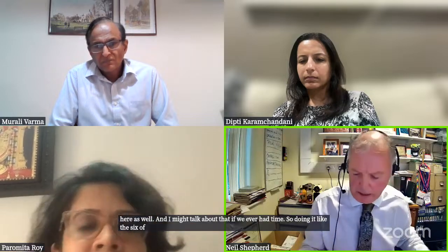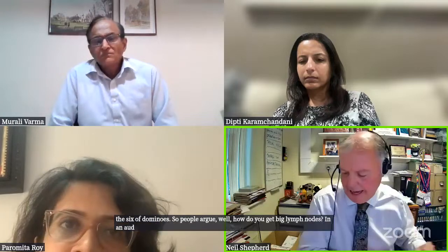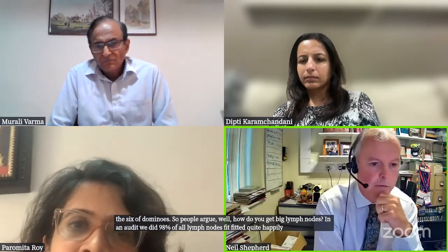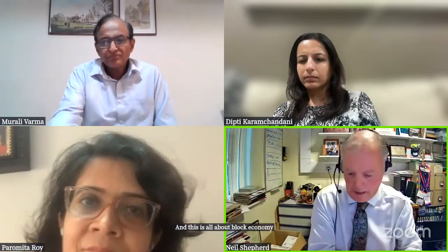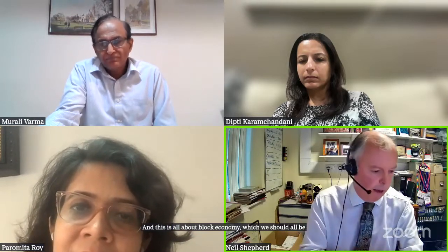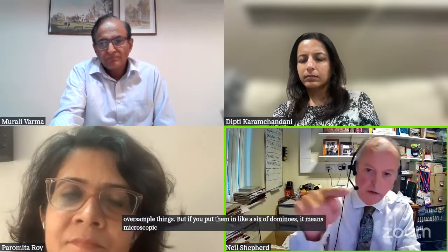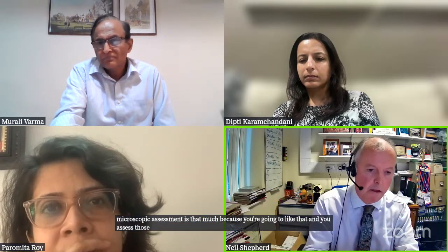People argue, well, how do you get big lymph nodes? In an audit we did, 98% of all lymph nodes fitted quite happily with their 5 brethren in one block. And this is all about block economy, which we should all be practicing. We've talked about how people oversample things, but if you put them in like a 6 of dominoes, microscopic assessment is that much quicker, because you go like that and you assess those 6 so much more quickly.